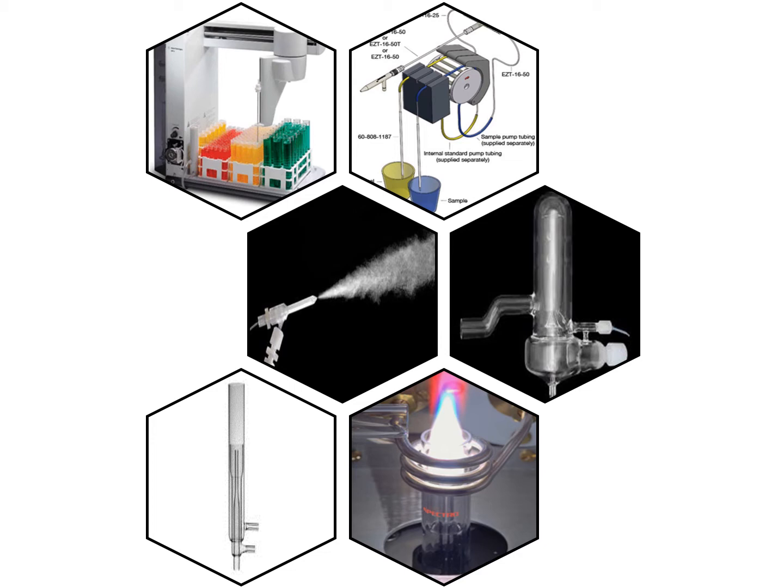And then the last tube on the outside has a very, very high flow of inert gas. That's usually, again, argon, because if you've got an argon bottle, you might as well just use that gas. And that basically keeps the plasma away from the edge of the glass tube, because the plasma is at 6,000 Kelvin, okay, which is extremely hot. And if that touched the glass tube, it would vaporize the tube instantly, and bad times all around.